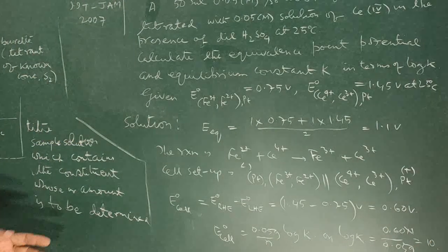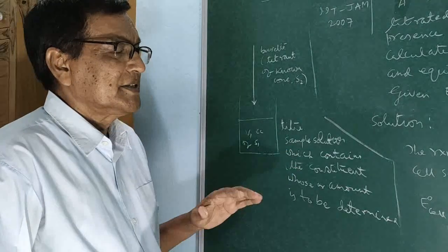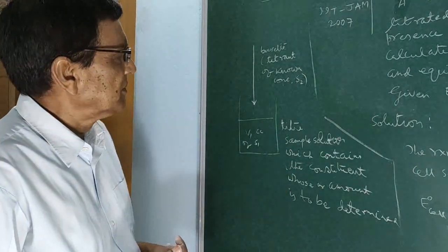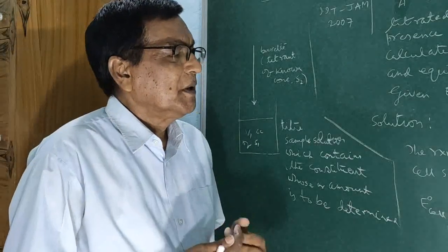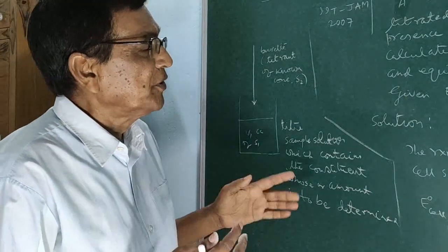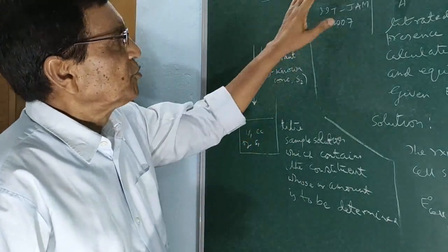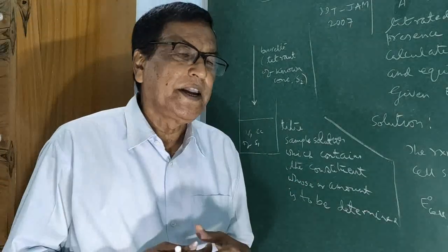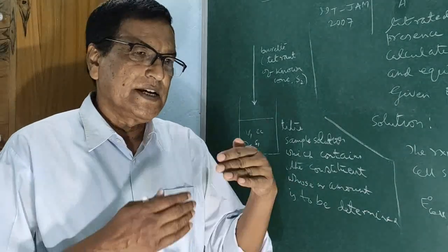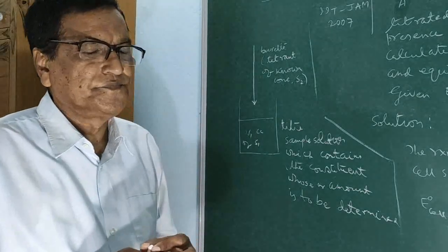So this is all about potentiometric titrations. I have discussed in detail, though some part may have been left out unknowingly. These titrations give a very accurate value of the end point, and the titration error is minimal.